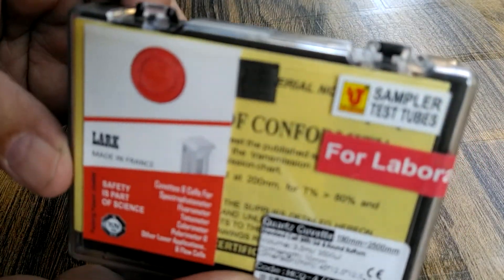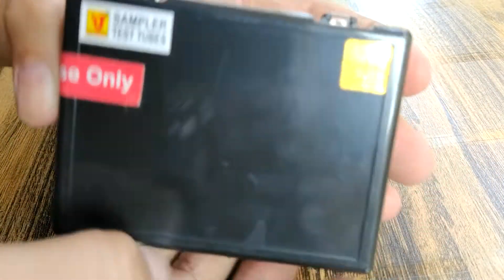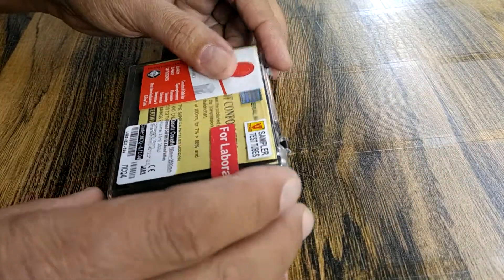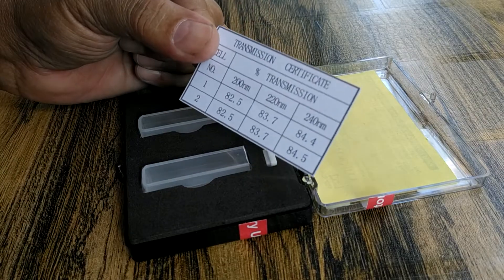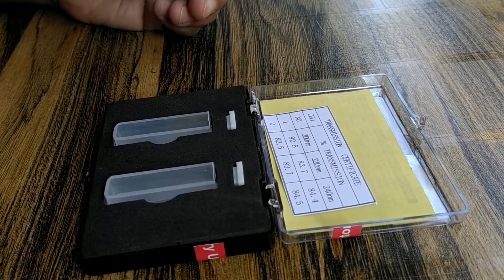Front view. Back view. And this — transmission certificate. And this package.